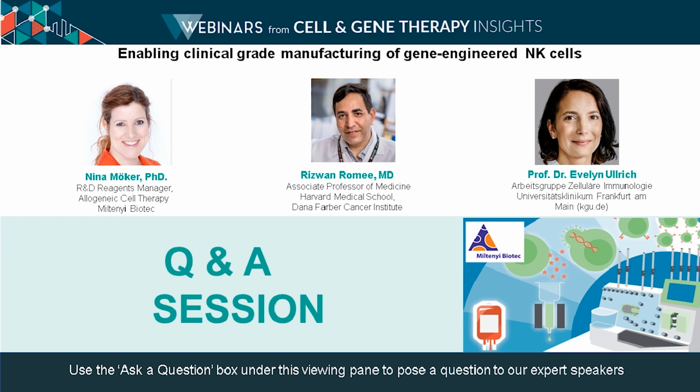Yes, thank you. So to translate the research workflow into a GMP-grade manufacturing process, our vision and strategy is to shift away from an open manual process towards a closed and automated system, so as to reduce the open steps as far as possible, because each manual step poses a risk for contamination as well as for human error. Each manual step is time intensive in the clean room. And one more strategy would be to reduce the required clean room class as far as possible to reduce the cost and effort to maintain the clean room.